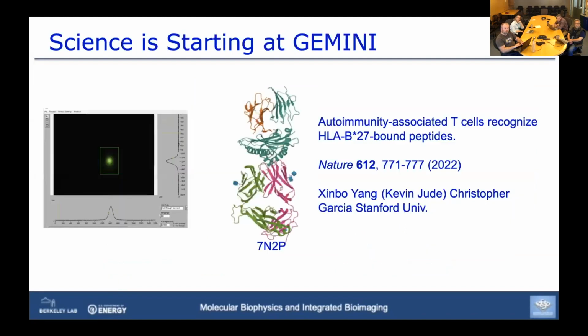The beauty of Gemini is that the science is starting with the small spot size. We just got our first PDB deposit last December, and we're quite happy to continue with the success, and the success of your projects that will be sent to the ALS-ENABLE beamline.